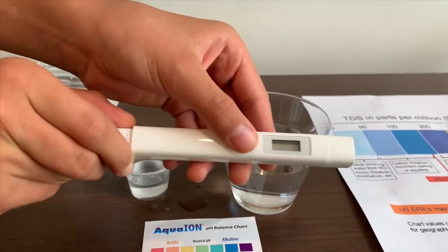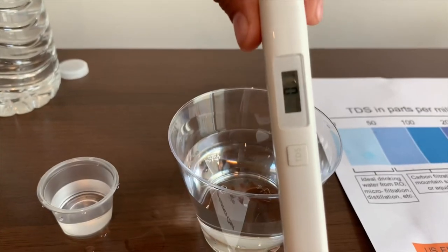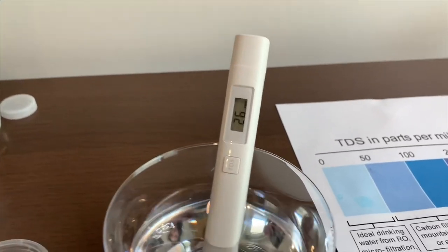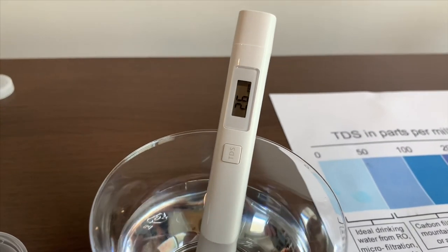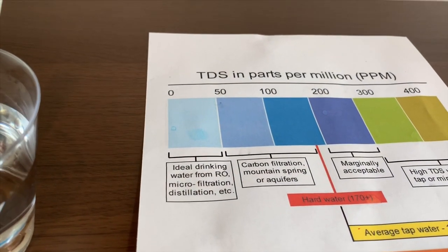Let's test the TDS level first. Make sure it says zero. Twenty-six — that is ideal drinking water.